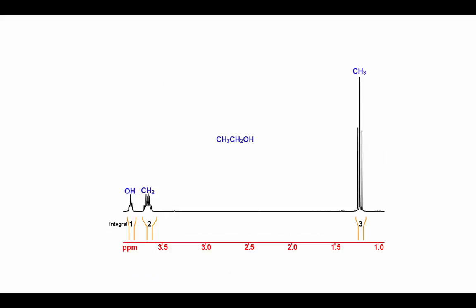Of course, in modern days, we can get much better NMR spectra with lots of information, including chemical shift and coupling constants. As NMR is so powerful to analyze organic molecules, even some people say, after NMR is developed, no more research. That's another abbreviation of NMR. With this great potential, multiple Nobel Prizes were awarded to NMR techniques during the last half a century.